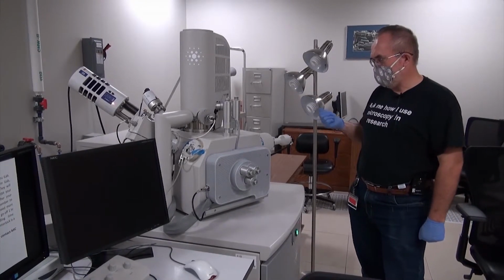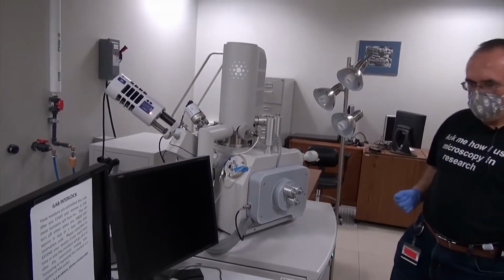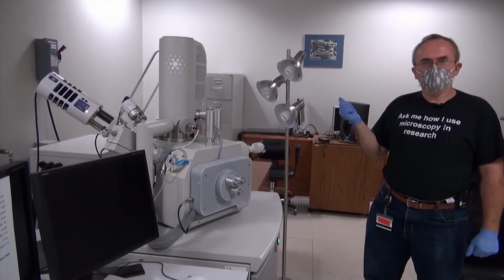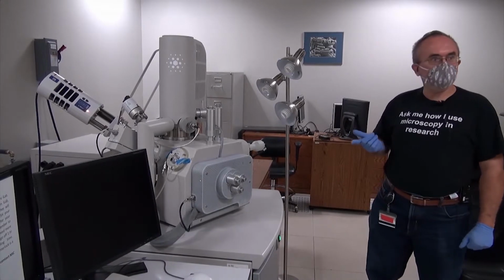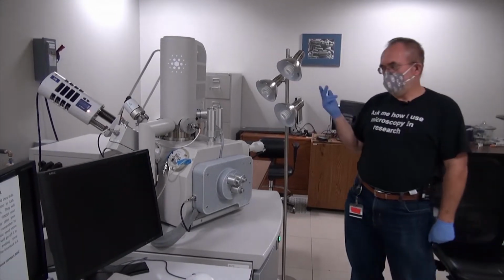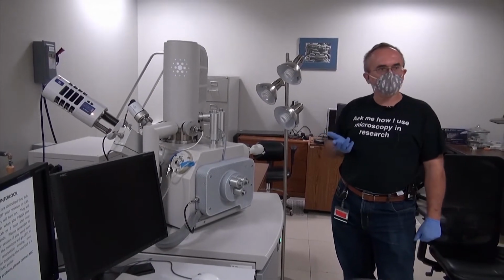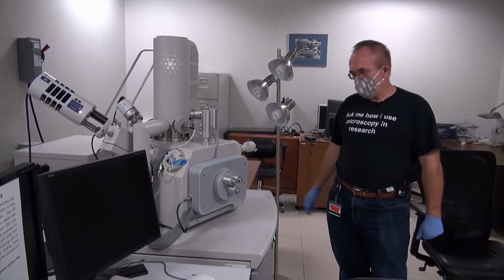It's equipped with an EDS detector. We have a backscattered electron detector, a regular secondary electron detector. We also have the EBSD system, which is the HKL Oxford system, and a Gatan camera with RGB filters.